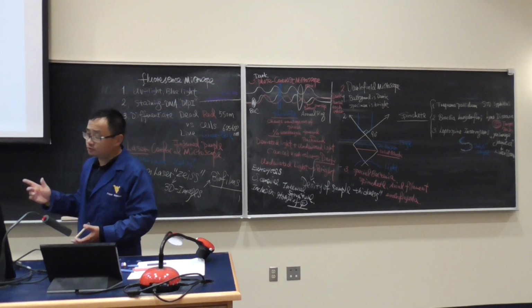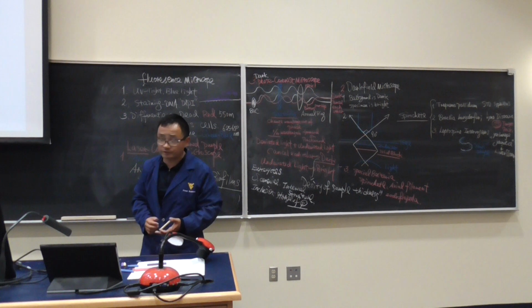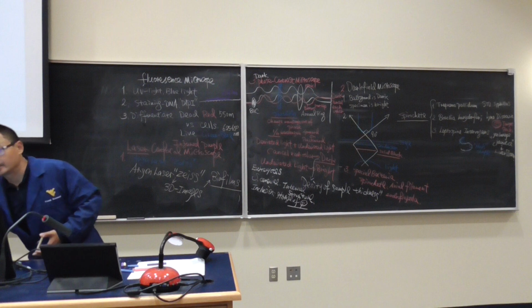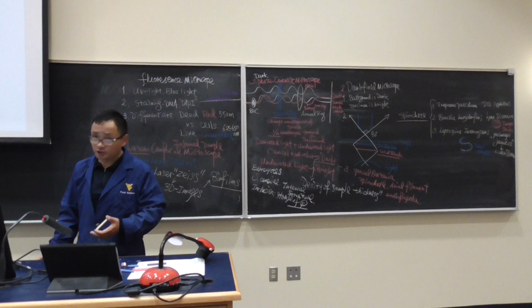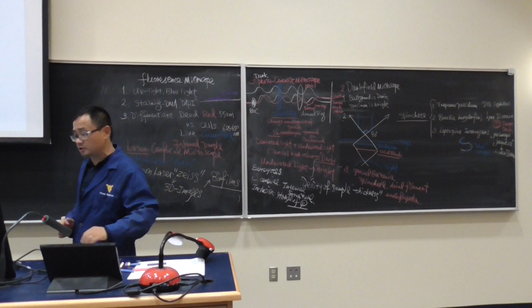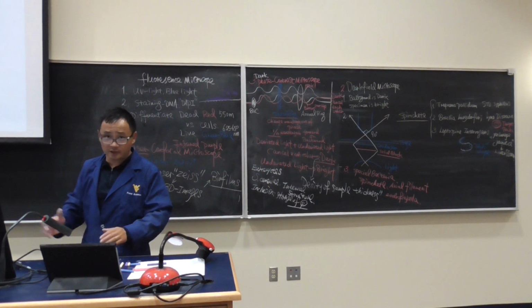The last one is I'm using the surfactants. The surfactants enlarge the exposed area of chlorine with bacteria. What you see, you see it's very clear. It is right in the middle. It's a big chunk of a light purple color, which means most of the cells with chlorine, with surfactants, start to injure. So this tells you using a laser confocal microscope could be very good to explain the morphology of a biofilm on the surface treated with the sanitizers.